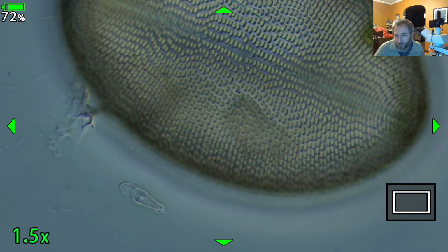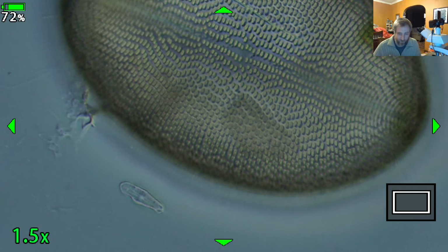And it's a pretty simple process. Once you have all that reaction complete, we just rinse out the samples, basically. I fill up the vial with water, and then shake up the sample. After we let it settle for a day, we vacuum off the top part of it with the vacuum line. There's a little bit of that material that's down at the bottom of the vial. So then we fill it back up with water, and basically you keep cutting out all the chemicals that way and reduce them down to some really small fractions. After you rinse them maybe 3 or 4 times, it's at the point where all the acids are neutralized or the oxidizers are neutralized.